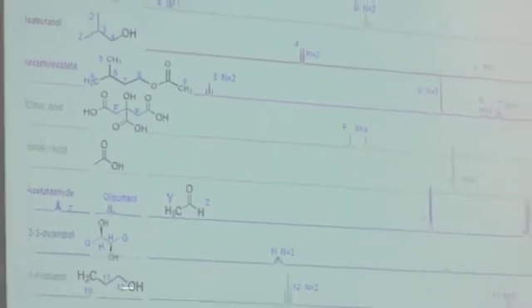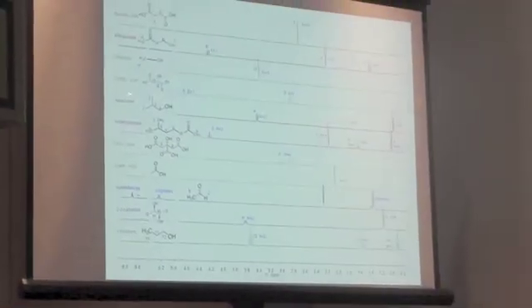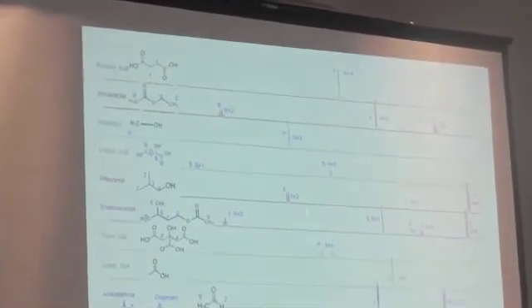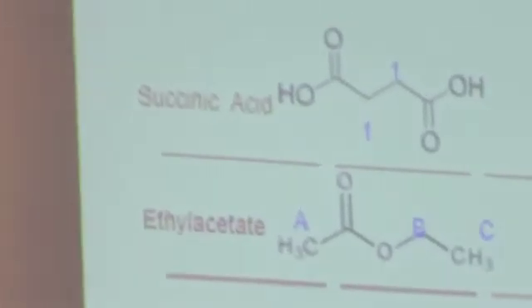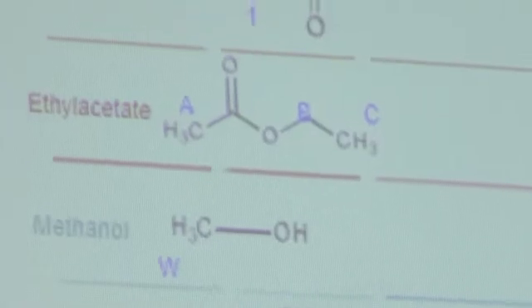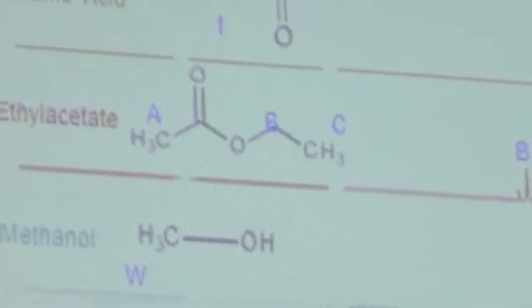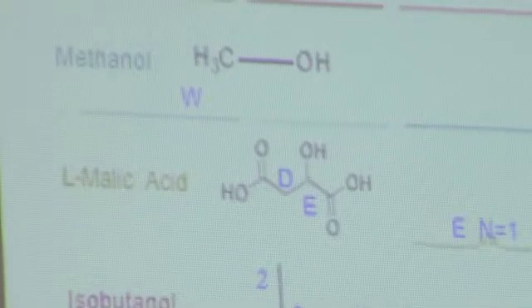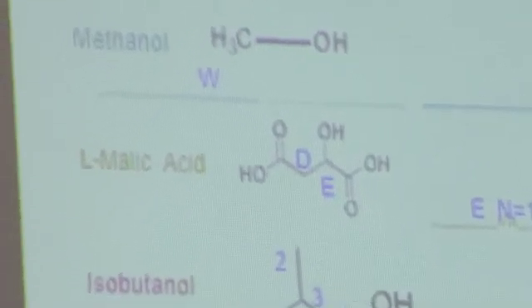You're going to get a big peak from something that's there a lot, and a very small peak from something that's there hardly any at all. And so this is spectra of things that you might find in the metabolome of a yeast, right? So you've got like succinic acid, which comes out of the yeast while it's going through fermentation. Ethyl acetate is when the ethanol reacts with the acetic acid that you produced. Methanol is like a baddie, it kills people in Russia when it's in the vodka. They're not very careful about the cuts there.